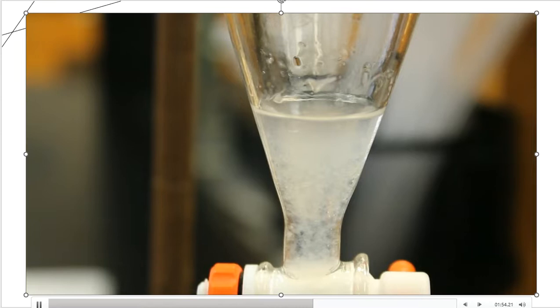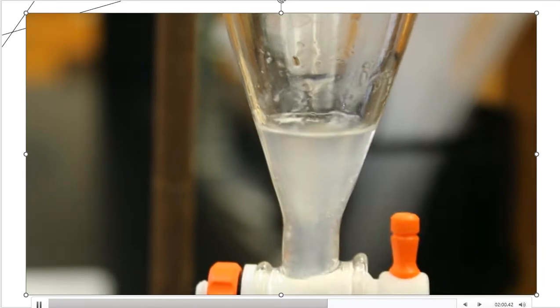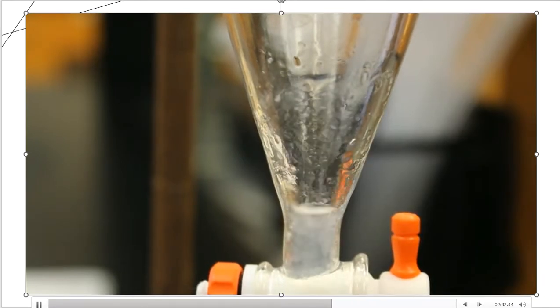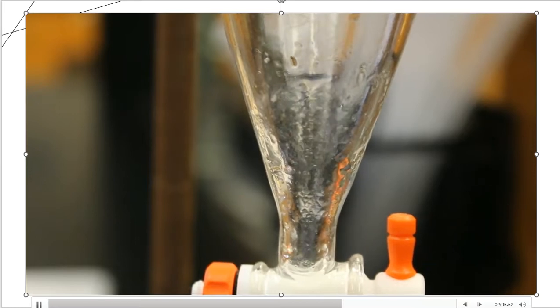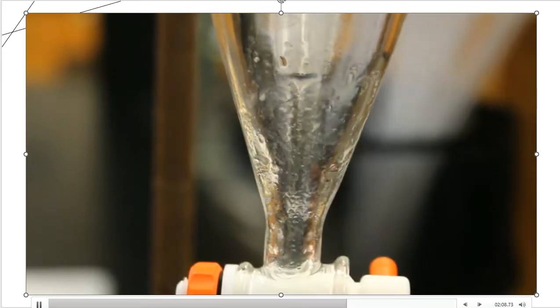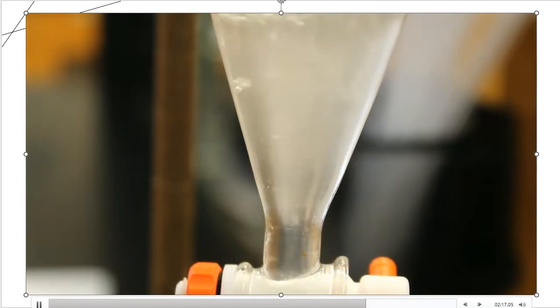All right, so now this sodium hydroxide we're going to get rid of. I'm just going to drain it into the same beaker that I drained the water into, so not a big deal there. So in it goes. All right. So now at this point, we're going to put the methylene chloride back into the separatory funnel. And again, this is where all of my product is at. So I'm just helping clean it. That's all that I'm doing.